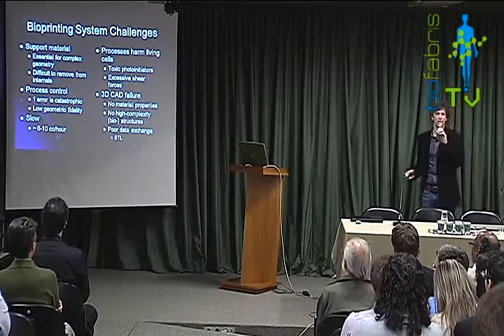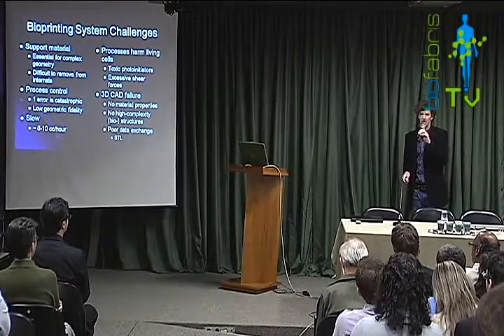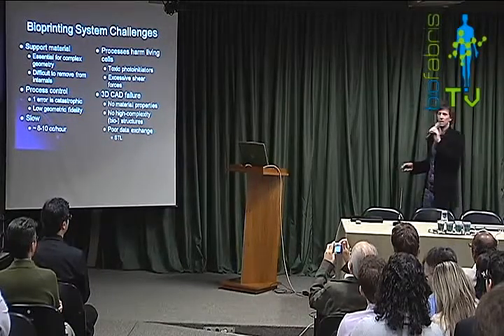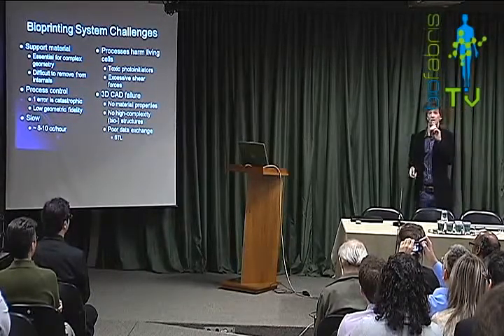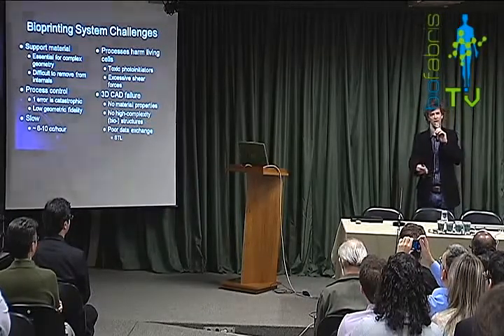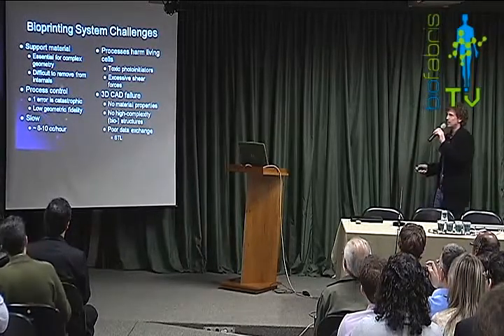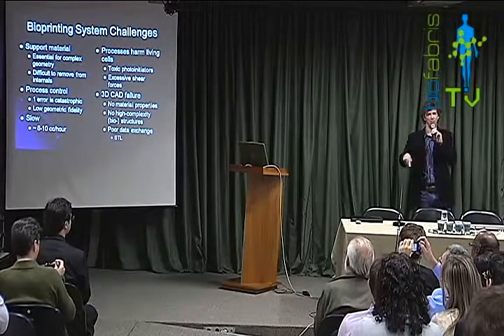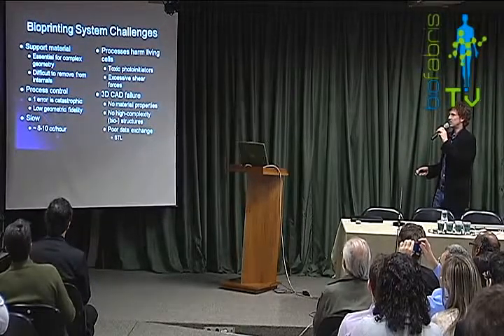Process control on almost all these, even the $1 million machines, is really inferior relative to the controls that your car has for monitoring its own health. These machines have nothing, they have no brain. So as it is, you can build something, it takes 42 hours to print a small object like this, and in the last hour the machine has a failure and the part is garbage. And you throw away a lot of material, a lot of time. In addition, you have low geometric fidelity because the machine is not aware of the errors it's making while it's building them. So this is a big initiative to improve these systems.